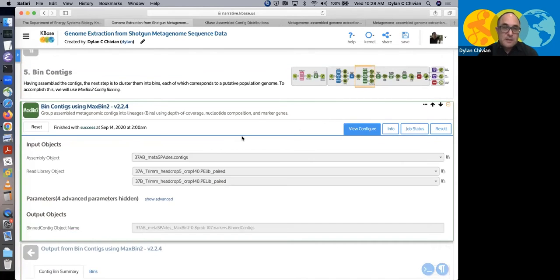As I mentioned, having variation in your samples is a very strong signal for binners, which these days all use relative abundance as one of the strong signals for trying to group the contigs into one lineage genome or bin.